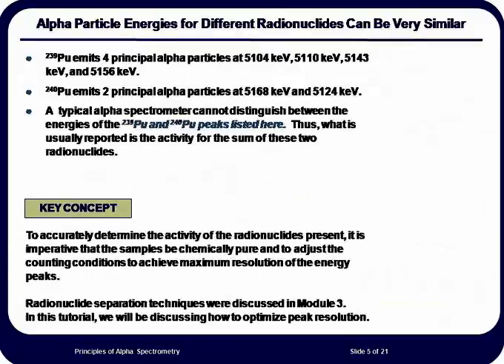When we compare the narrow span of energies that we see for alpha particles and the resolving ability of our spectrometers, it becomes imperative that our chemical separation techniques completely separate one radionuclide from another when they are chemically different. The need for reproducible and exacting techniques for source preparation is also a critical step in achieving good spectrometric resolution.